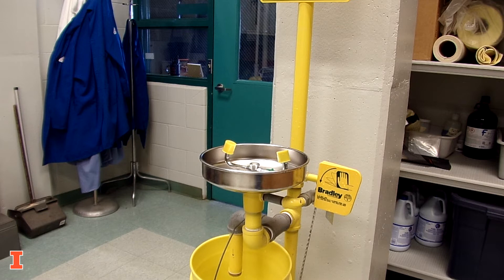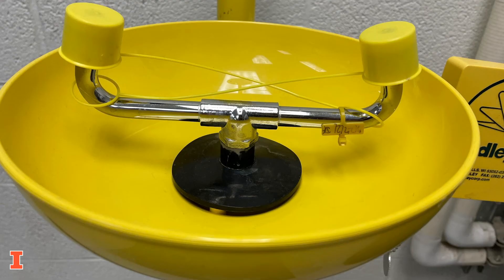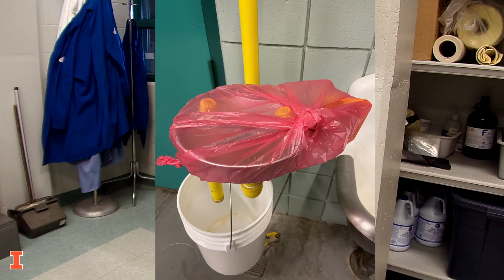DRS performs an annual, more comprehensive test of all eyewashes on campus. A green tag means that all parameters are within their limit. A yellow tag means that at least one parameter is outside of the required limit, but the eyewash can still be used. Eyewashes that cannot be used will be covered with a red bag.